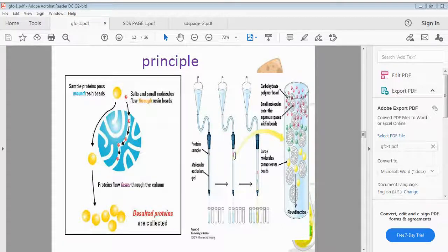The molecules much smaller in size than the red colored ones will enter and also come out easily. But those molecules whose diameter is the same as the diameter of the pore, after they enter, they get entrapped in the gel. So the size of the molecules varies. They may be big like the yellow one, they may be exactly the same diameter as the pore size of the gel, or they may be smaller than the pore size of the gel.